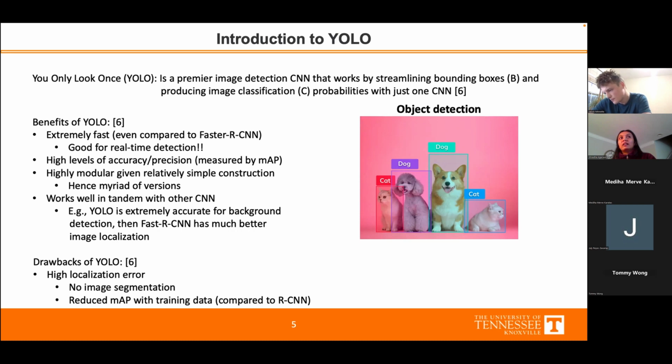And you know that our voids are, say, 20 nanometer by 20 nanometer. So what we do is we define anchor boxes. So what happens is when your model predicts your bounding boxes, it optimizes with respect to those predefined boxes. It just helps in computation because something is already predefined of that shape. And now you have a prediction. Now the predicted bounding boxes would be regressed. That's why YOLO is known as a regressor problem.